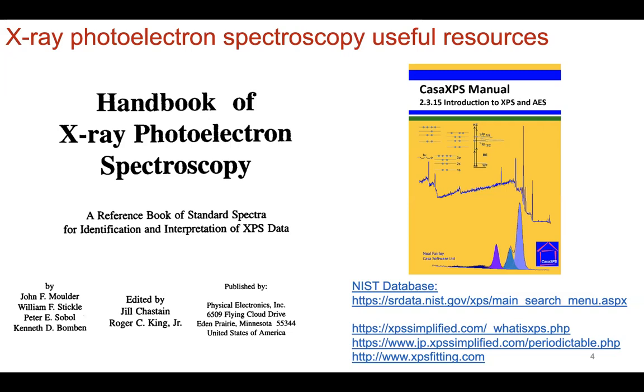And this goes back to what Modesta was saying about X-ray absorption spectra, which is one could overinterpret if one doesn't have enough chemical information, or one overinterprets because you have more information you're trying to squeeze in and overfit the data. That can also happen.